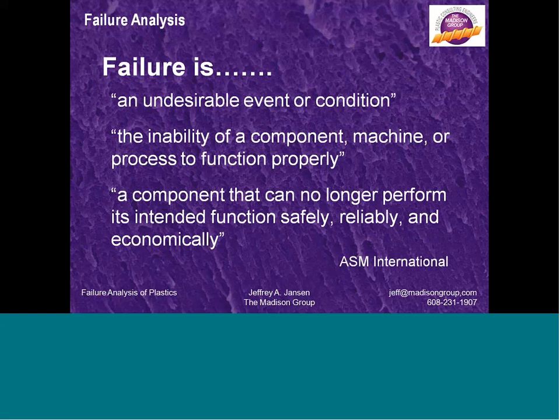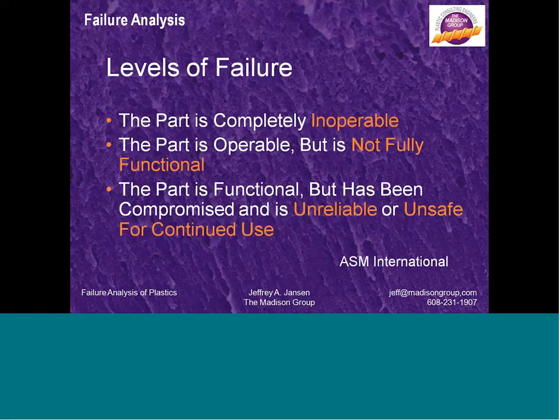First of all, let's jump right in and define what we mean by failure. There are a number of different ways that we can define it: an undesirable event or condition, the inability of the component to function properly, a component that no longer performs as intended. All of these really mean that something's not working the way it was originally intended to work. That may be a catastrophic break or failure. It may be something more mundane like a cosmetic or appearance change. But again, it's not performing the way it was intended.